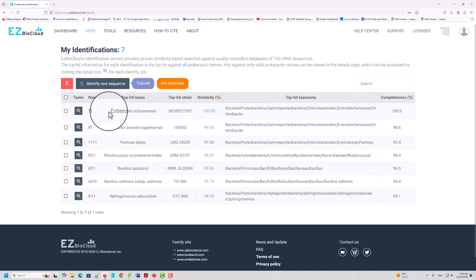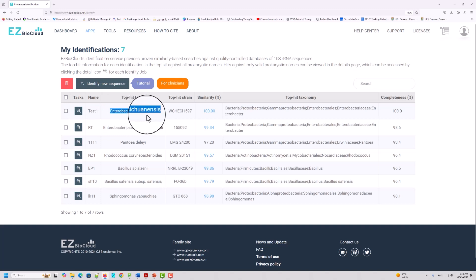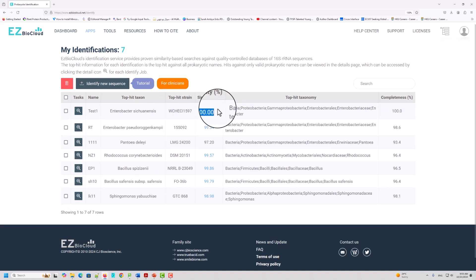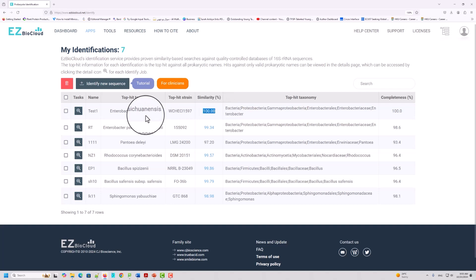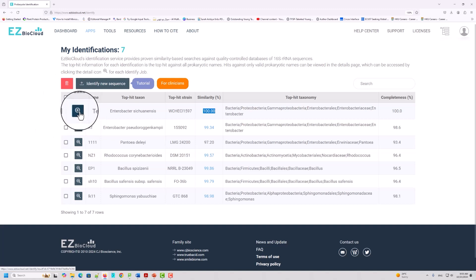Now you can see that it is processing your sequence. The top hit is Enterobacter — I'm not sure how to pronounce the full name — situensis. This is the bacteria, and this is the strain name. The similarity is 100%. The top strand result is this one. If you want more detail and want to make a phylogenetic tree using this EzBioCloud database, you can click the plus sign.